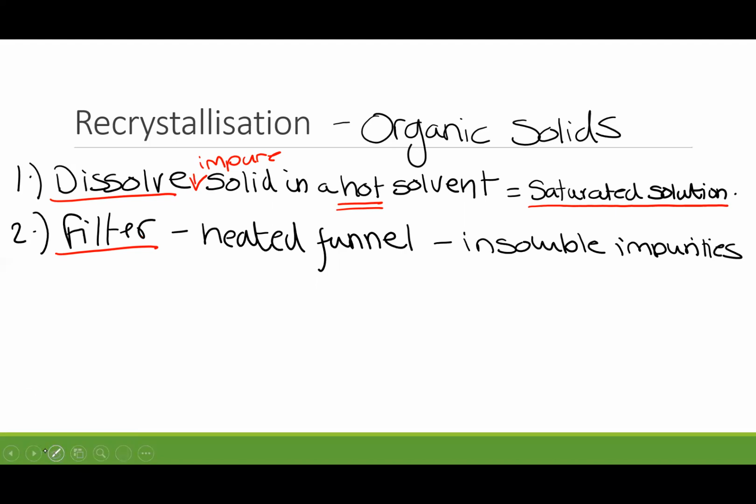And then we do what we said before, we leave the mixture now to cool down. We leave it to cool down slowly. We don't do anything to it. We don't make it cool down any quicker. We leave it to cool down slowly. As it cools down slowly, crystals will form.